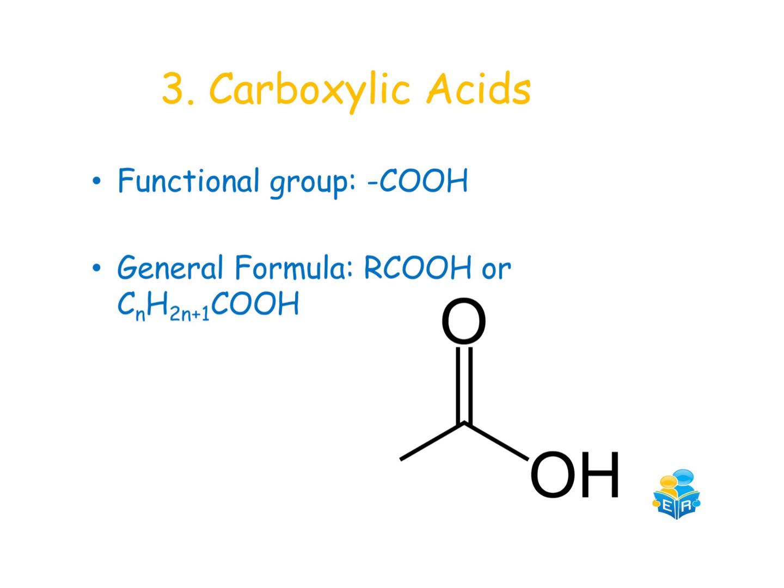So touching on just what I said a few minutes ago about knowing the theory behind the experiments and also where they originate from, the experiment that we're focusing on today is the amount of ethanoic acid that is present in vinegar. So this is obviously linking into your carboxylic acids, and we know that our carboxylic acid has a functional group of COOH.